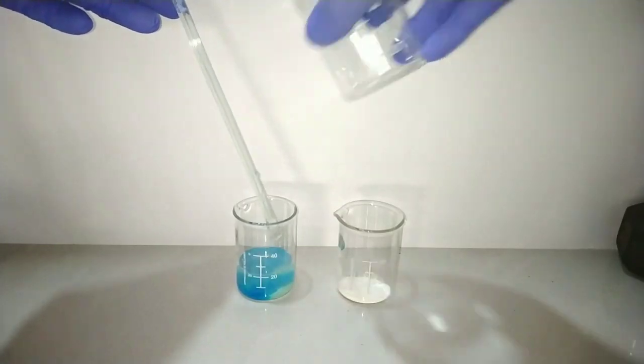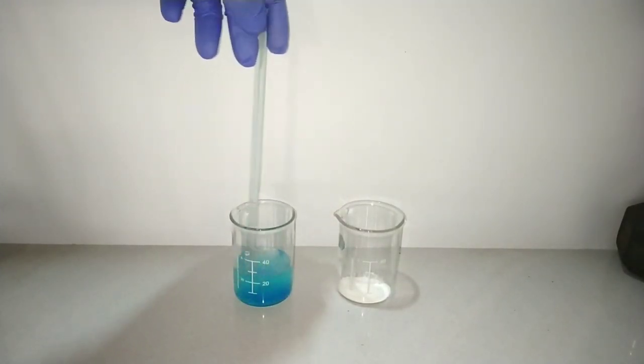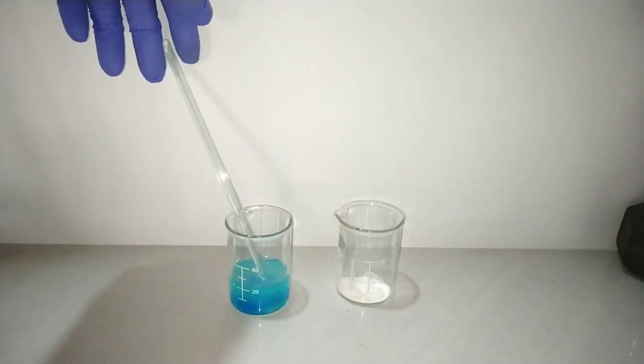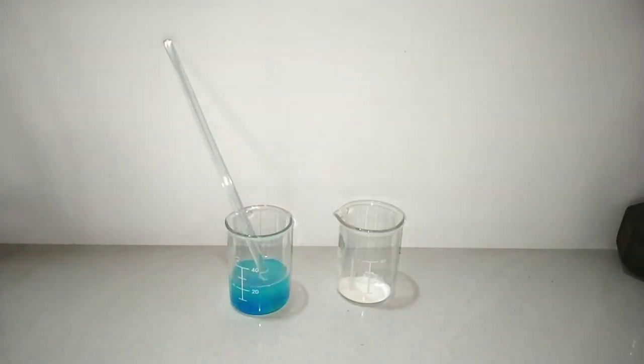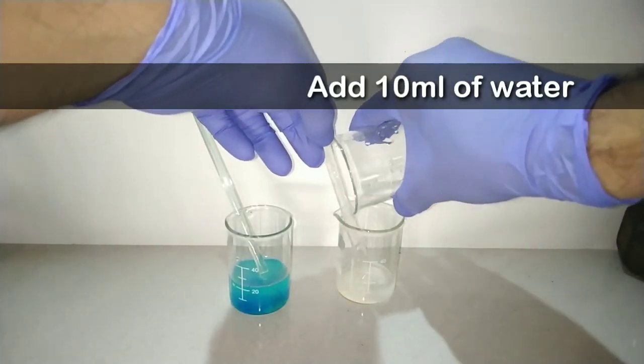We get a nice blue color solution on mixing the copper 2 sulfate. Now we add 10 milliliters of distilled water into the sodium metabisulfite and dissolve that too.